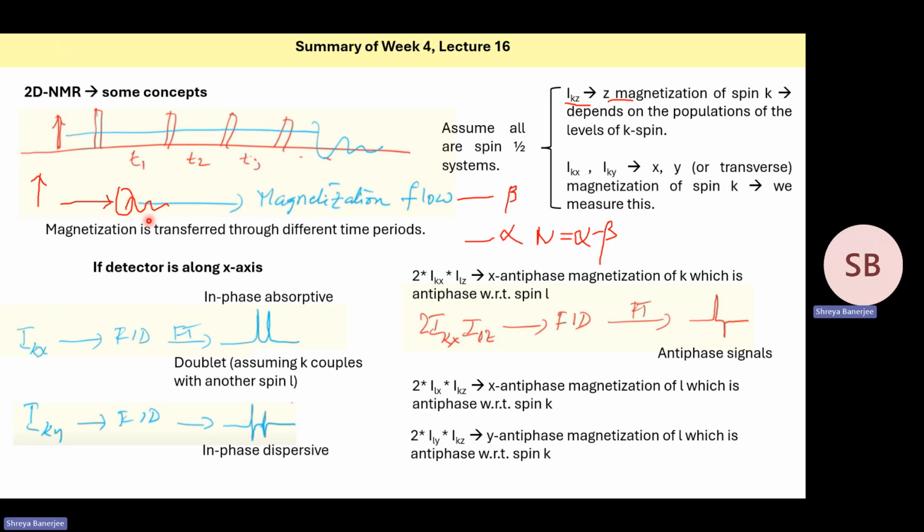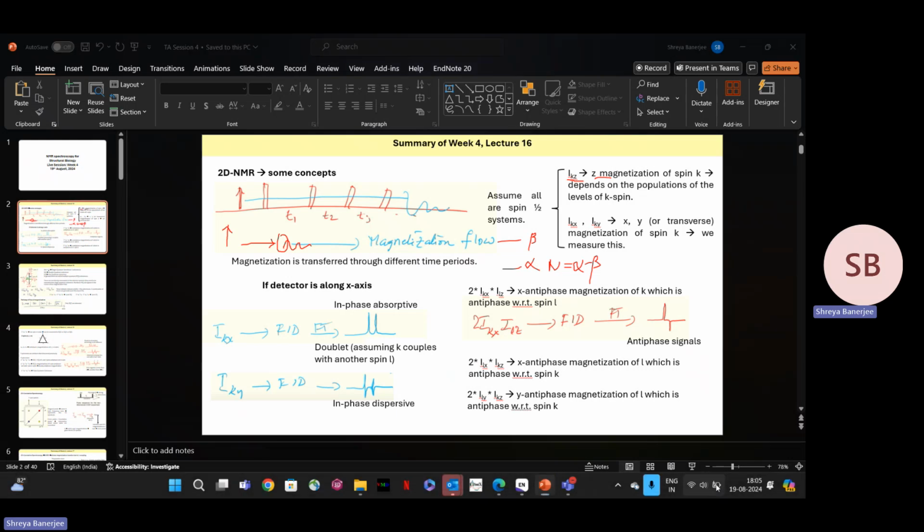And if you do Fourier transform of this FID, just one second. Excuse me, one second.